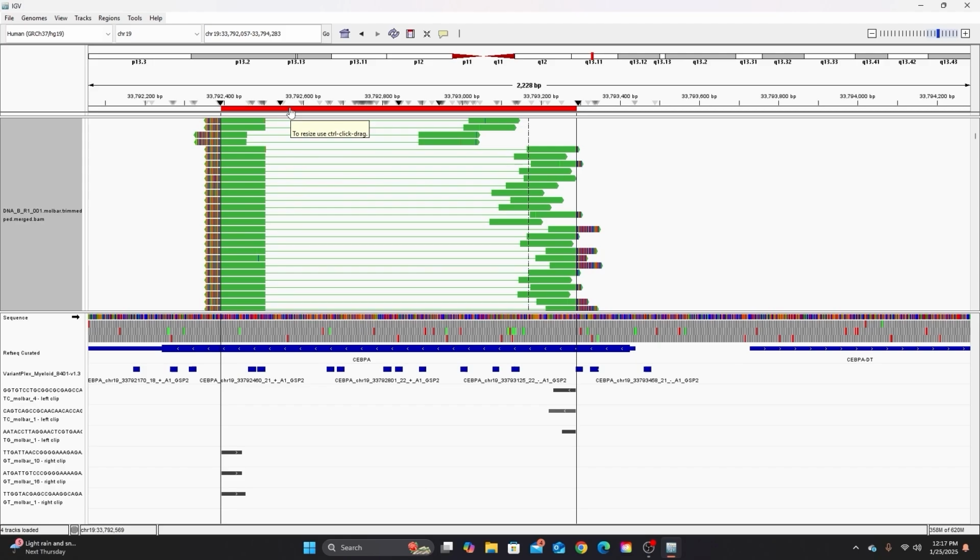They have not flipped directions, suggesting that there is not an inversion here, but instead there's a segment of the patient's genome that is being copied where it shouldn't be. Now, in the patient, these forward reads are normal until here, and then a section of the genome all the way over here has been copied over here, right? So there's this very far away section from the same chromosome, but that got copied over here.